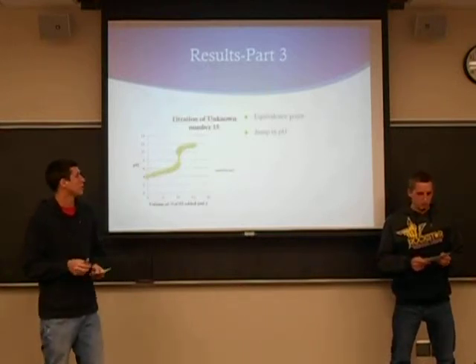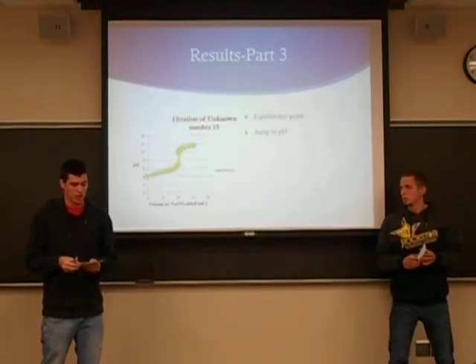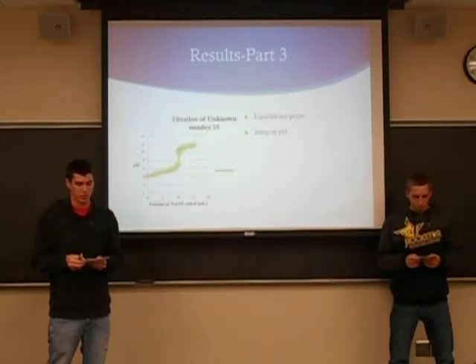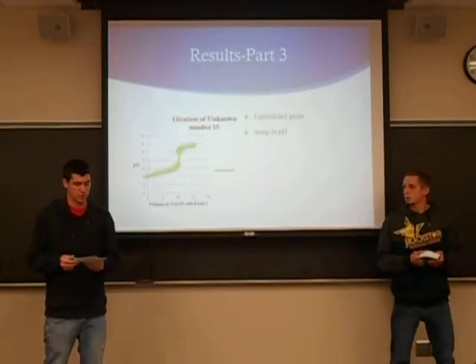And for each part, the HCl had a molarity of 0.1, and acetic acid had a molarity of 0.12, and then the mass of the unknown was found to be 0.205 grams.